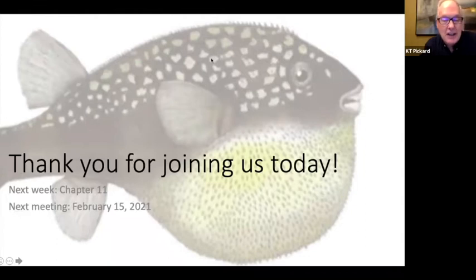So we'll build on this next week, and you can see that this was a little messy. There are challenges with all these command lines. You can see it's kind of fraught with real-time peril, and we extract all of this and move it into Terra next week, and you'll see that a lot of this will be moving away, and I won't have all the messiness of worrying about environment variables and that sort of thing. Thank you for your patience as I work through that one. I'll stop for questions and see you.